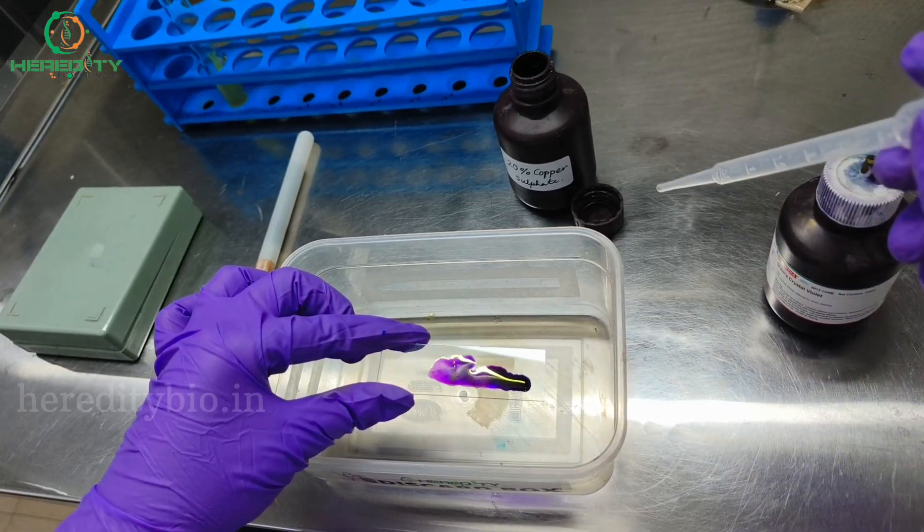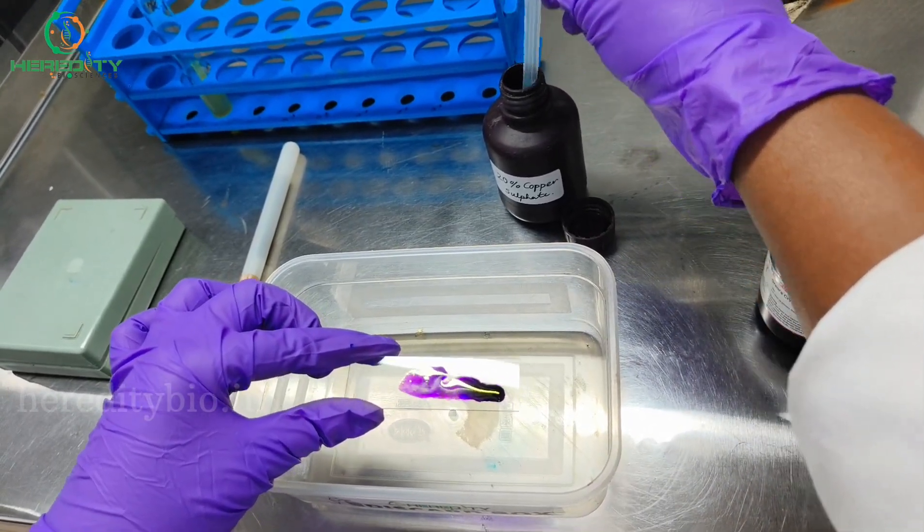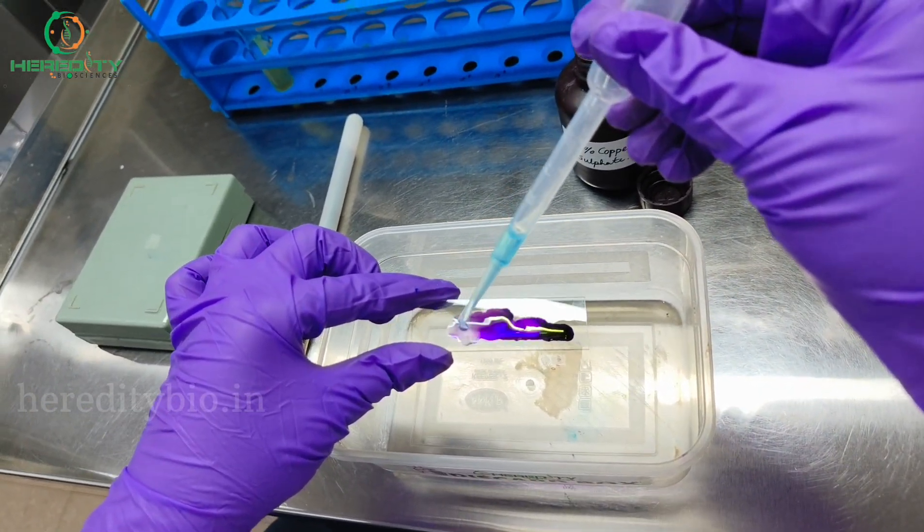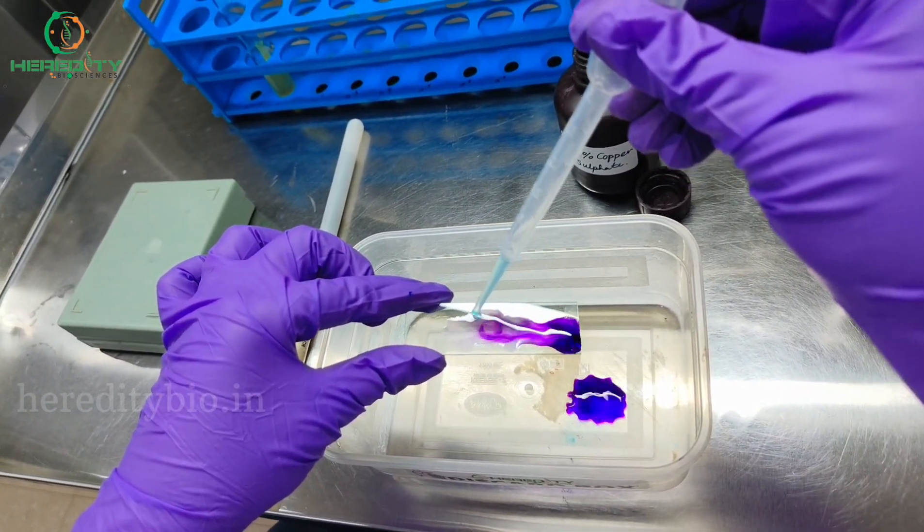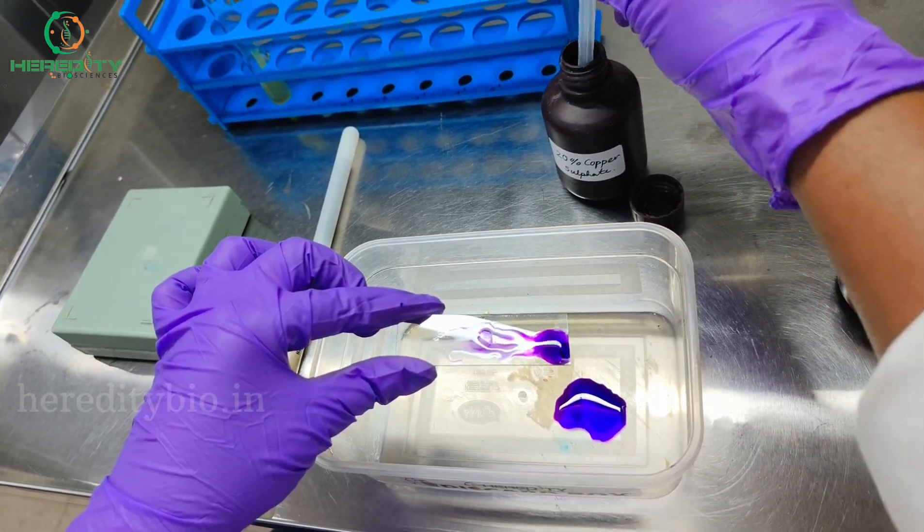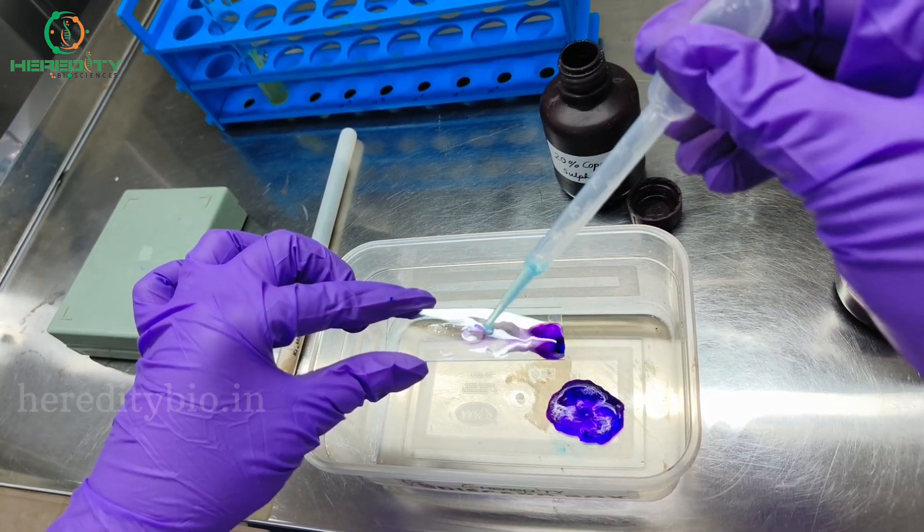After two minutes, wash it out using 20% copper sulfate. Do not use tap water for washing. Do the decolorization until the excess color of crystal violet rinses out.